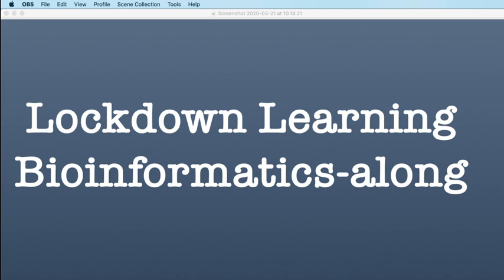So I realised that a lot of the recent lessons have been fairly hands-off and have been quite a lot of listening to me prattle on a little bit about various concepts. Today is going to be a bit more hands-on, so today is much more about getting this script written and getting it running. And then tomorrow we're going to turn our attention to R. So that's where we're going to be from tomorrow, getting R installed and running, and then trying to work with R to analyse this data that we've downloaded and then generated over the last couple of weeks. So that's the plan for today.